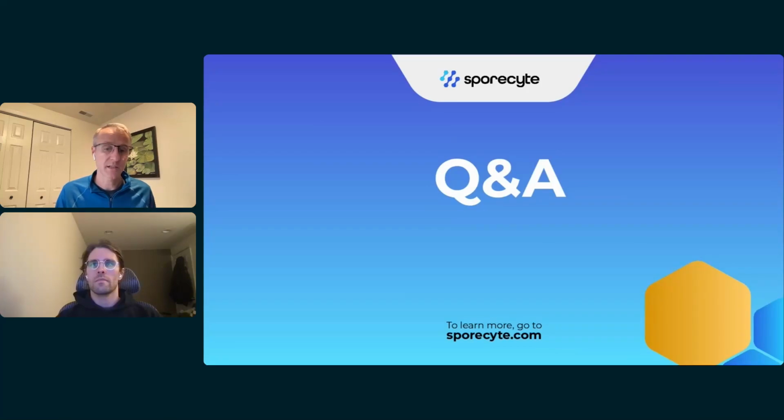So we test with the holdout data set and with our comparative study data sets to see that the overall performance of the algorithm is acceptable. Again, we don't need perfection here. We just need to be within the statistically valid range. And with the analyst review, if the algorithm makes mistakes significant enough to affect the reporting, we'll catch those in the analyst review.